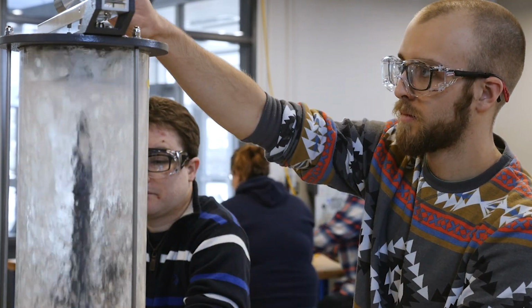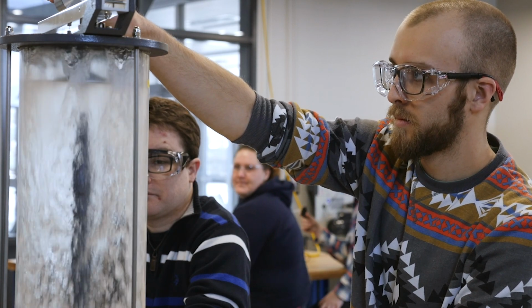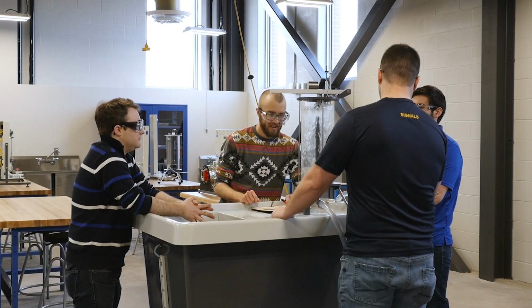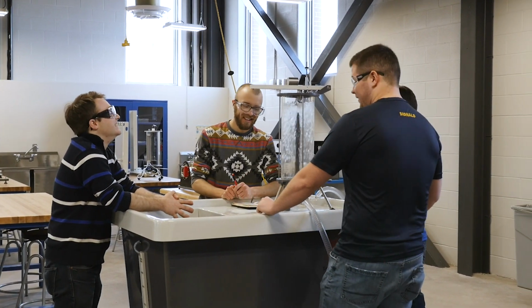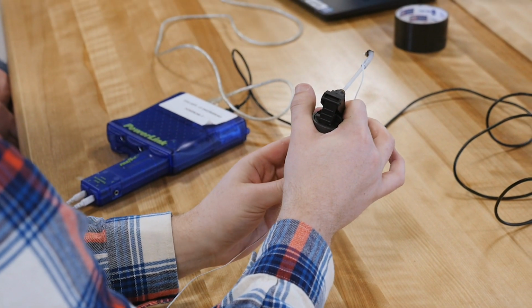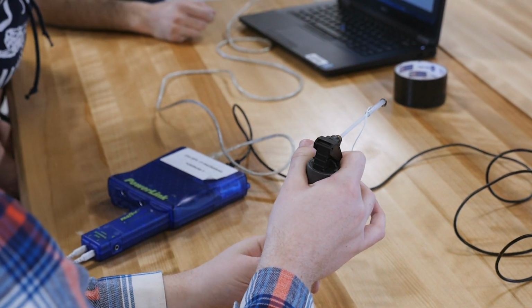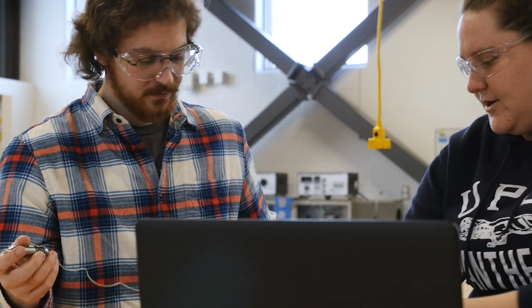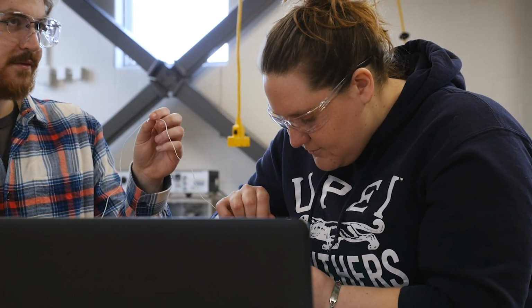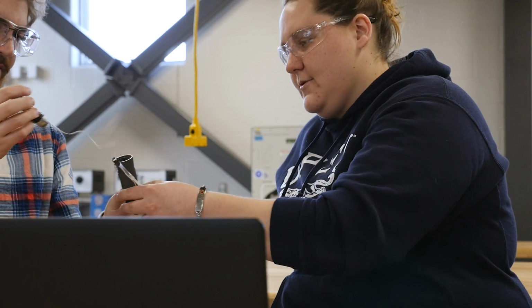In the Faculty of Sustainable Design Engineering, or FSDE, laboratory and workshop activities will be a key part of your experiential learning. However, laboratory activities frequently involve the use of equipment and chemicals that are hazardous if not used safely. Making sure that laboratories are safe is the responsibility of everyone that is involved: administrators, faculty, staff, and students.